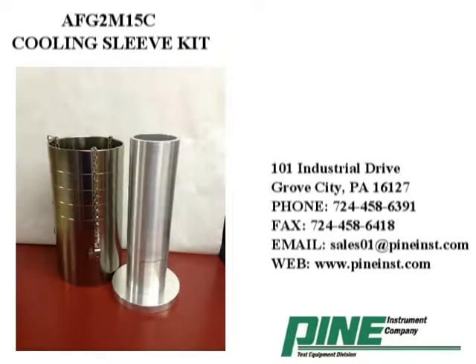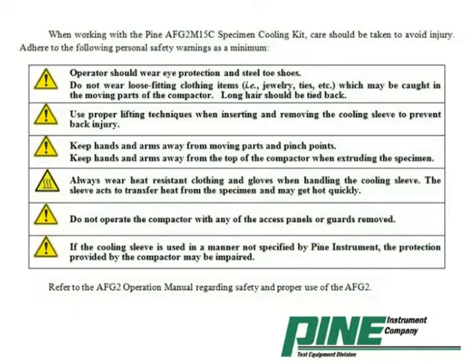Welcome to the Pine Instrument Company Test Equipment Division instructional video on how to use the AFG2M15C cooling sleeve kit. Be sure to conduct the following safety measures as a minimum.